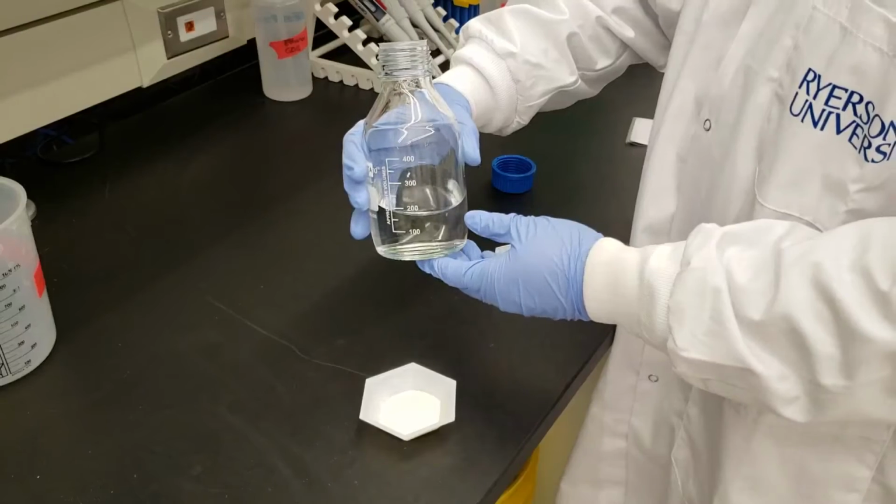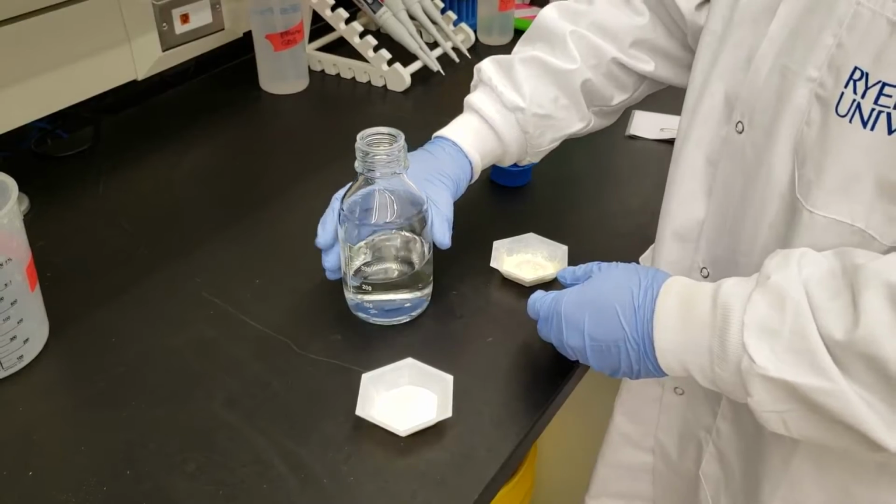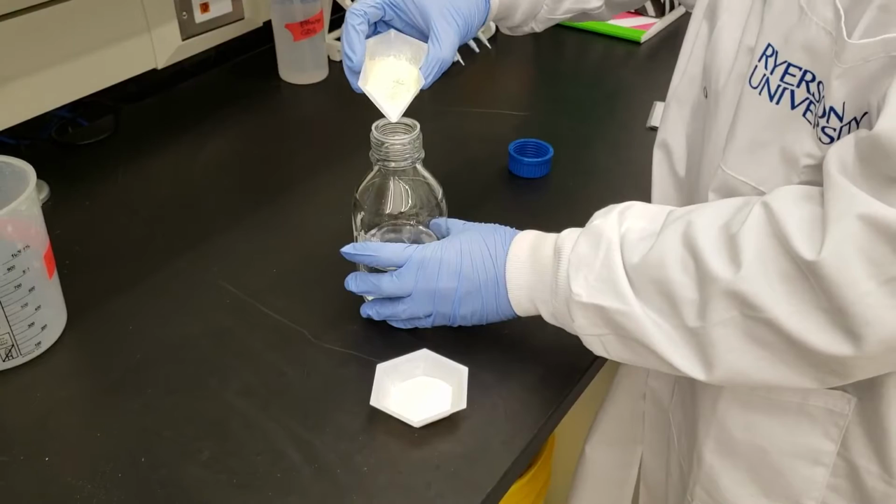Okay, we're good to go. We've already filled up our container with 200 milliliters of distilled water. Then we're going to carefully take our reagent powders and pour them into the container.